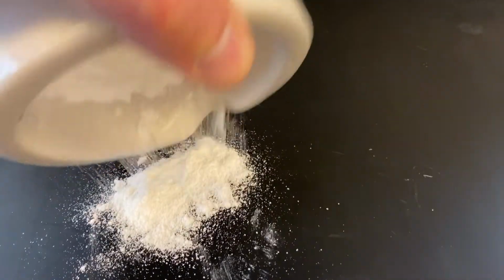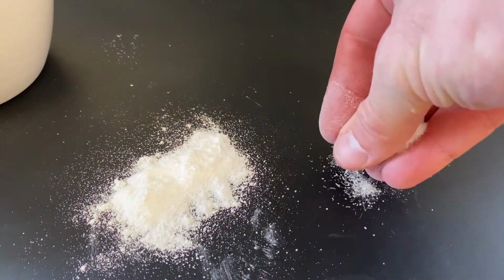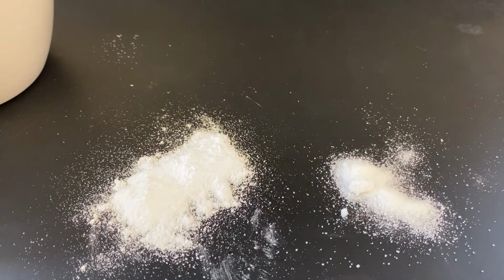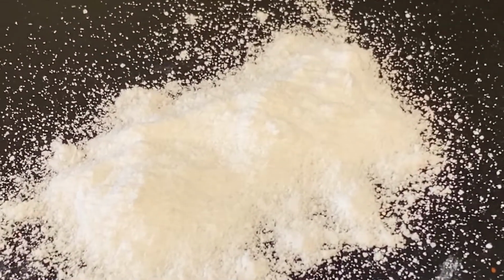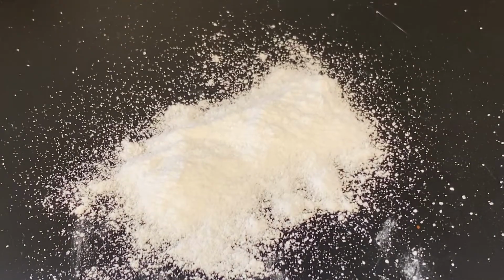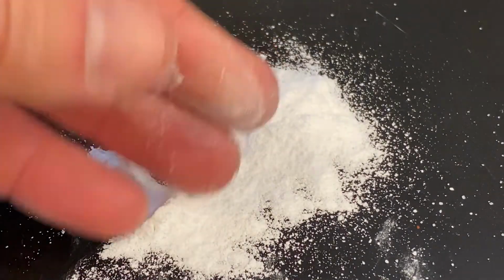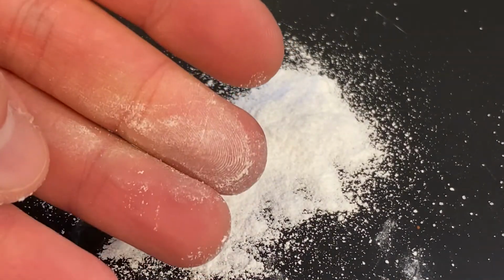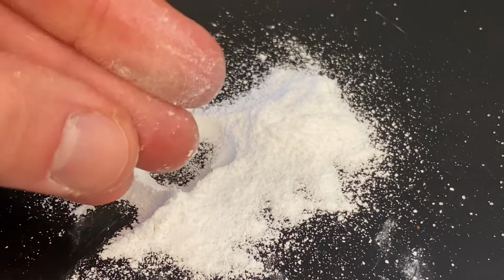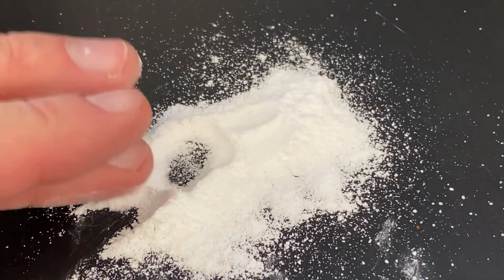It's very powdery, as opposed to even what regular store-bought sugar looks like, where it's a little bit more grainy. I don't know if you can tell the difference there, okay? But the stuff on the right is a little chunkier than even the stuff on the left. It's a little more of a powdered form, kind of like powdered sugar. It's definitely a lot finer in texture, okay? As you can see, almost like powdered sugar. It feels a little gritty, but when I touch it softly, it feels smooth, kind of soft and fluffy.